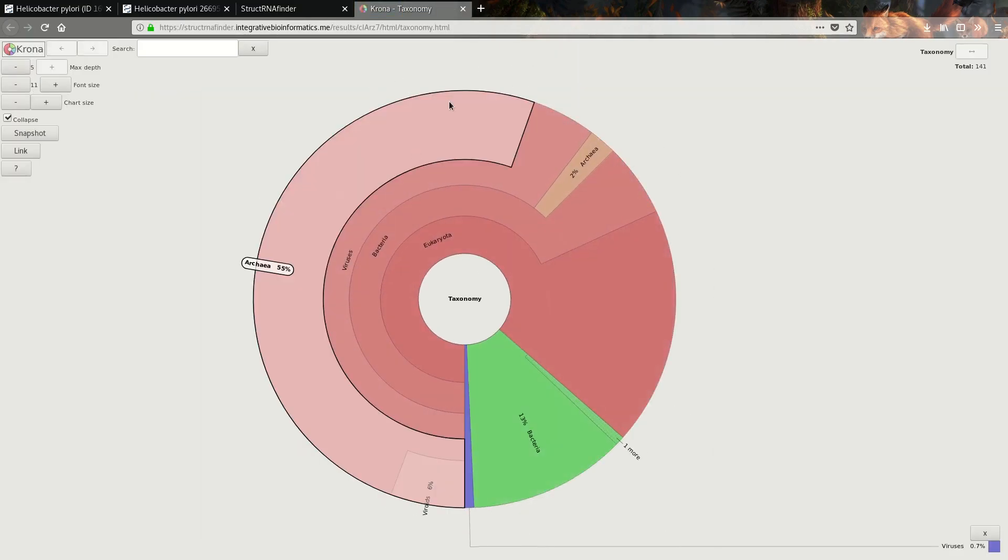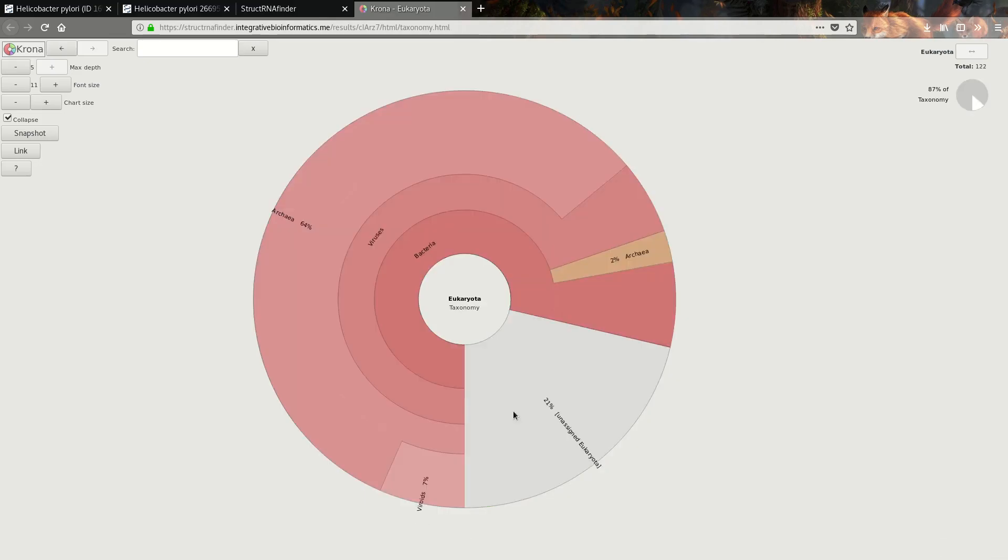Then we have taxonomy. Here you can see in which family the RNA belongs. For example, 55% belongs to the Archaea, 13% to bacteria, 6% to viroids, 0.7% to viruses, and 21% belongs to unassigned Eukaryota.